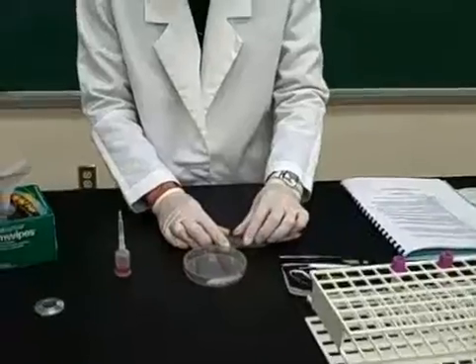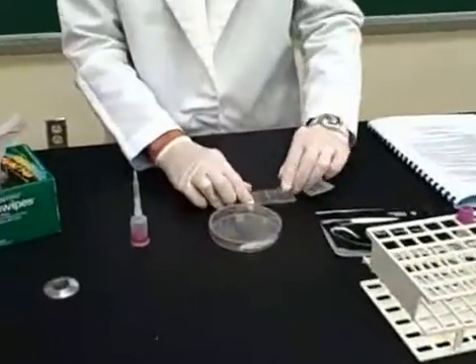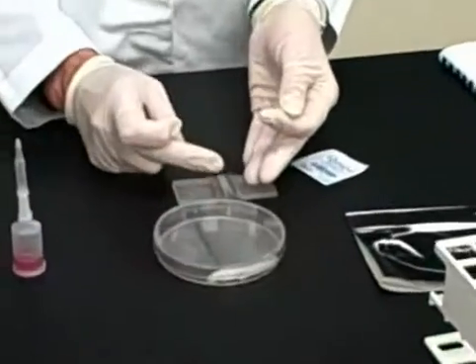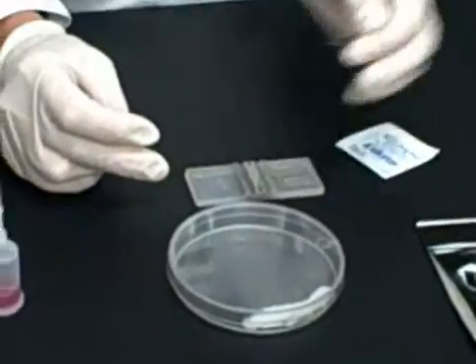The Neubauer hemocytometer is the most common one used. It is basically a slide that has gratings on both sides of the platen, and you can get your count in cubic millimeters.